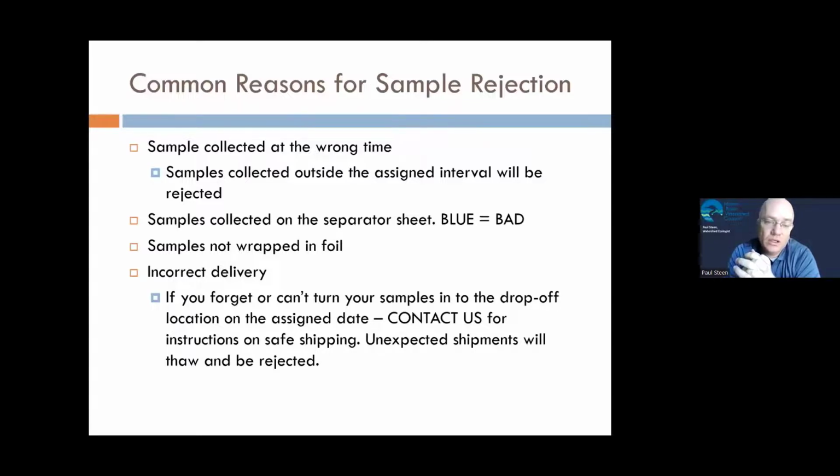If you try to filter your sample through one of those blue separator sheets, your sample will get rejected. We can't analyze that. It wasn't collected properly. Blue equals bad. Don't try to filter through a separator sheet.